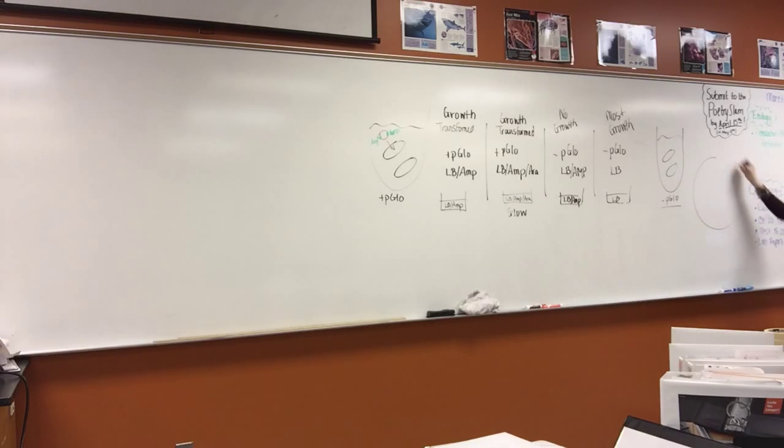So when you did this yesterday and put the 100 microliters on here, when you spread it around with the loop, there was so much bacteria, a whole bunch you couldn't see, but you were spreading it around. You put it in the incubator overnight, the bacteria start to divide, and there are so many that when they divide, making colonies, all the colonies merge together.